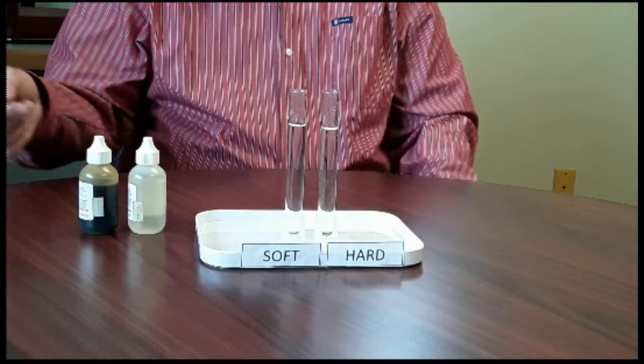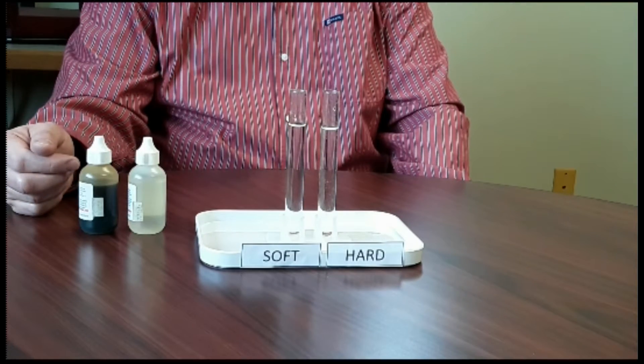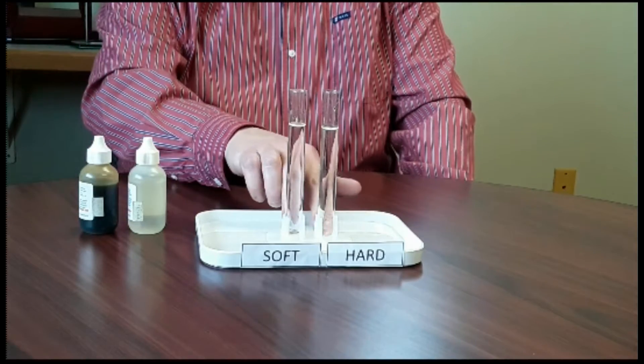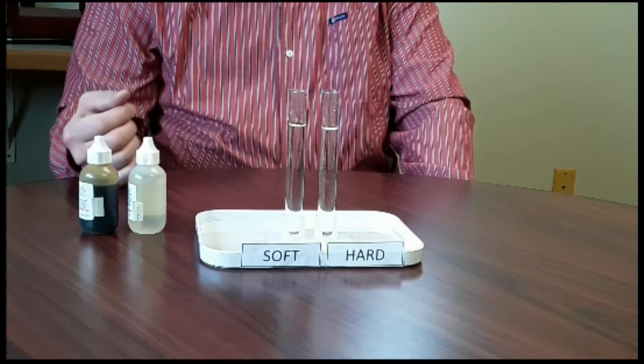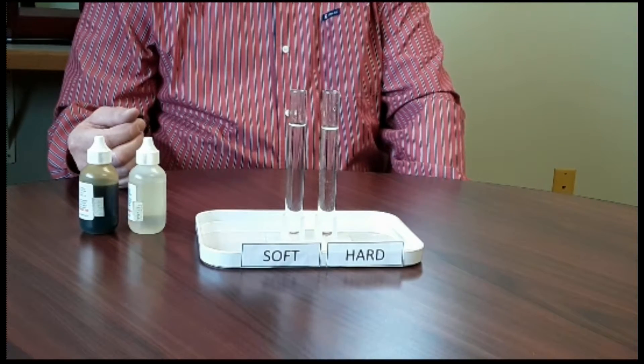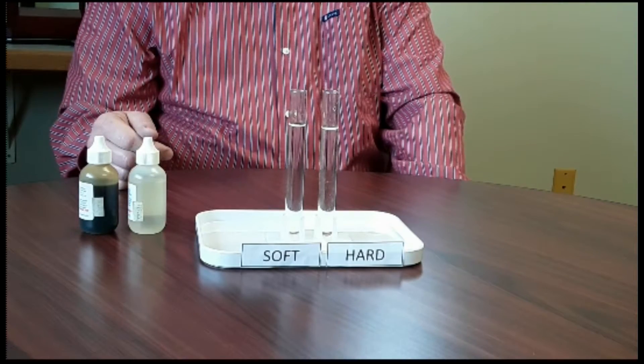We're here today to show you a precipitation test. What we're going to do is add two solutions - hard water in one vial, soft water in another vial. This is going to physically let us see the hardness in your water, which is the dissolved solids, calcium, and magnesium.